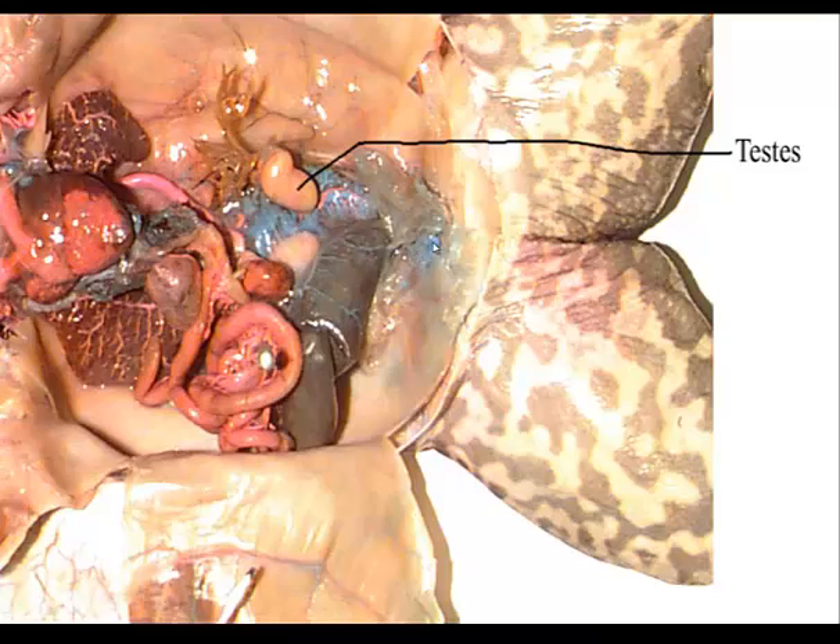If looking at a male, obviously no ovaries with eggs. The testes are going to be small kidney-bean shaped, yellowish or tan colored, near the anterior ends of the kidney. Find the kidneys, trace them up, and you'll find the testes. There will be several small ducts that carry sperm into the kidney, and sperm exits through the kidney along with urine through the cloaca.